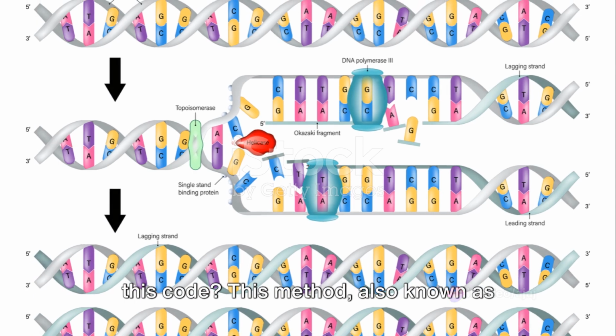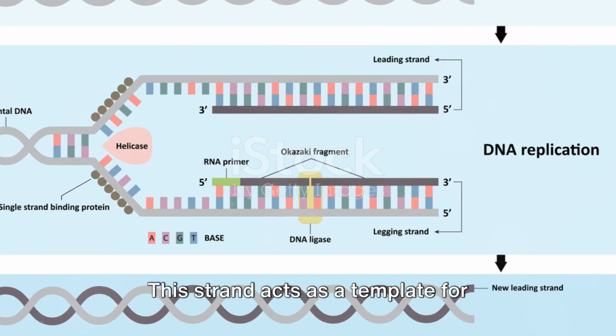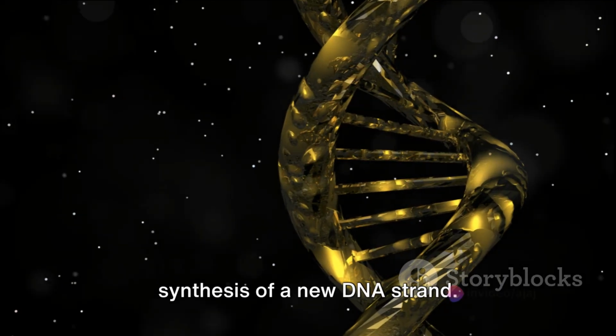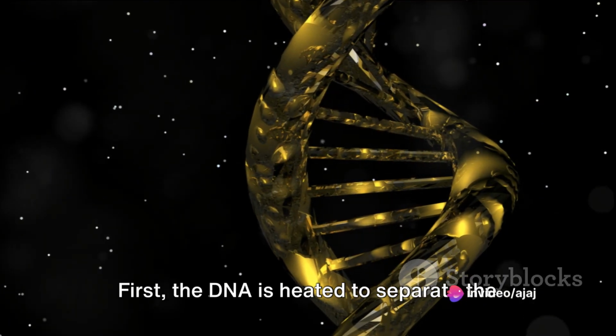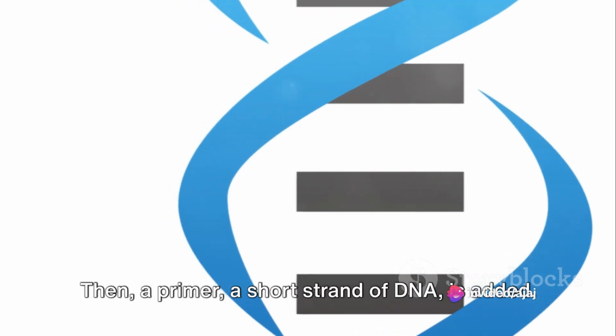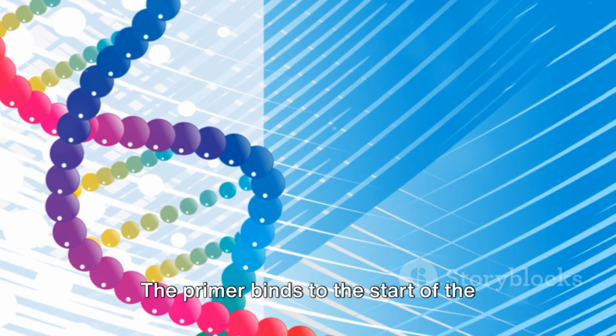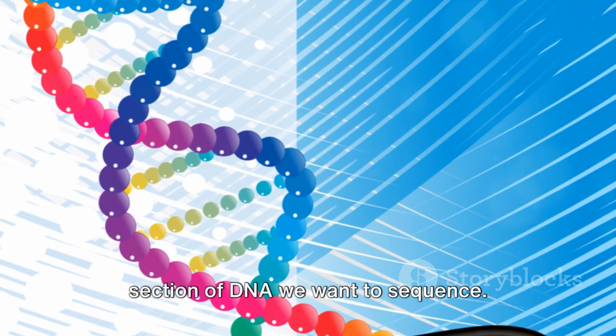This method, also known as chain termination method, starts with a single strand of DNA. This strand acts as a template for synthesis of a new DNA strand. First, the DNA is heated to separate the 2 strands. Then a primer, a short strand of DNA, is added. The primer binds to the start of the section of DNA we want to sequence.